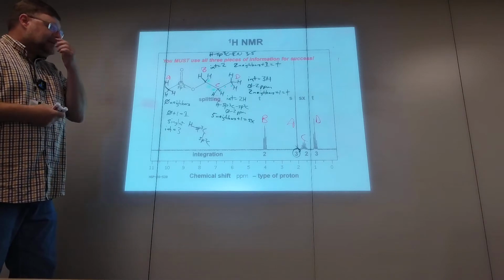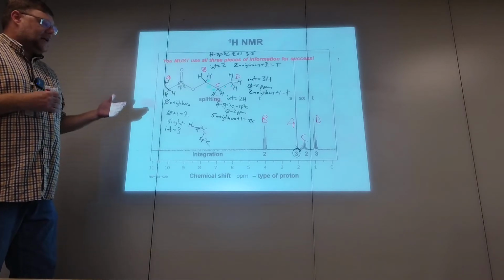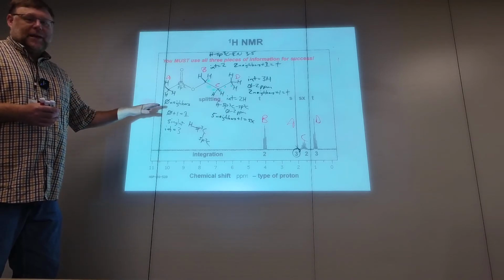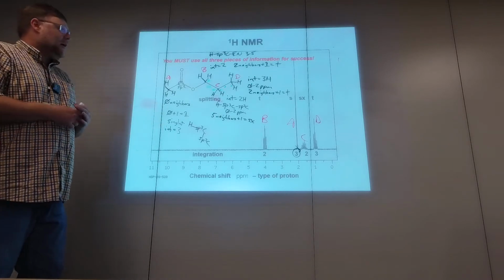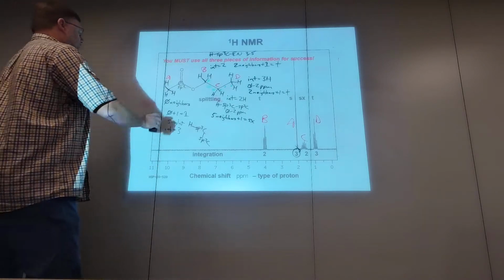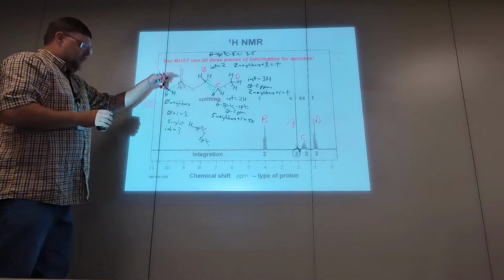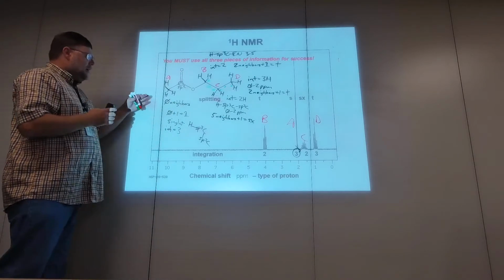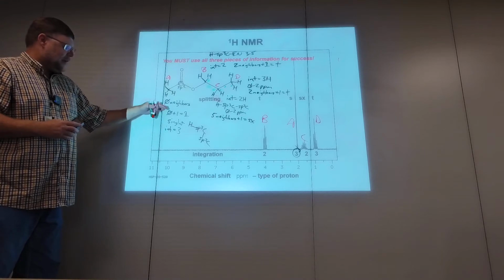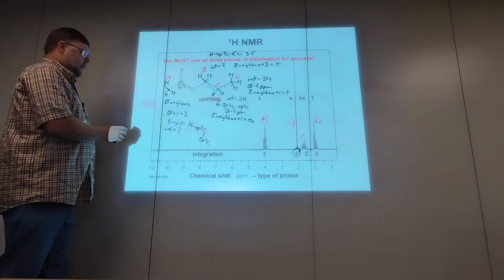Okay? So that's how you assign protons to peaks. You can watch that again if you want. I'm going to go on to another molecule. I'm going to do it a little bit faster because I'm at 21 minutes, but I hope that made sense to you. You want to think about all of those. You got to make the neighbors fit, you got to make the chemical shift fit, and you got to make the integration fit for an assignment.